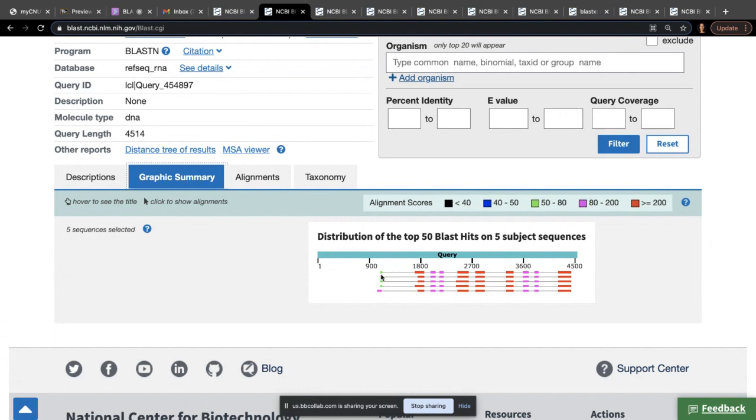So this part here of the match, show me the little hand, there you go. Okay, that's that gene that we even know the function for. And it's going to say the same thing on this one. Come on, just show me. Okay, there you go. So is that gene? I knew it was the same because it has this line connecting, but this is a different hit from this. But these are the different variants of that human gene.